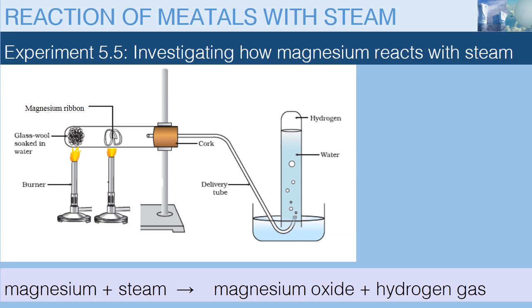The equation for this reaction is shown below. Magnesium reacts with steam to form magnesium oxide, which is the white powder, and hydrogen gas — that is the colorless gas that is collected at the end of this experiment.